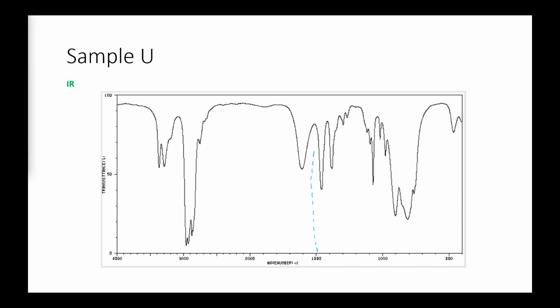And already we can see a couple of signals are coming to light. So for instance, the first signal we have at about 1600, we're seeing here this rather broad signal. It's a little bit lower than we would potentially expect for a carbonyl group, so that's a carbon with a doubly bonded oxygen. The tables say above 1680, and this is about 1600, but I'm going to pop it in there because it is coming up, and so we don't want to dismiss it. Keep an eye on that there.